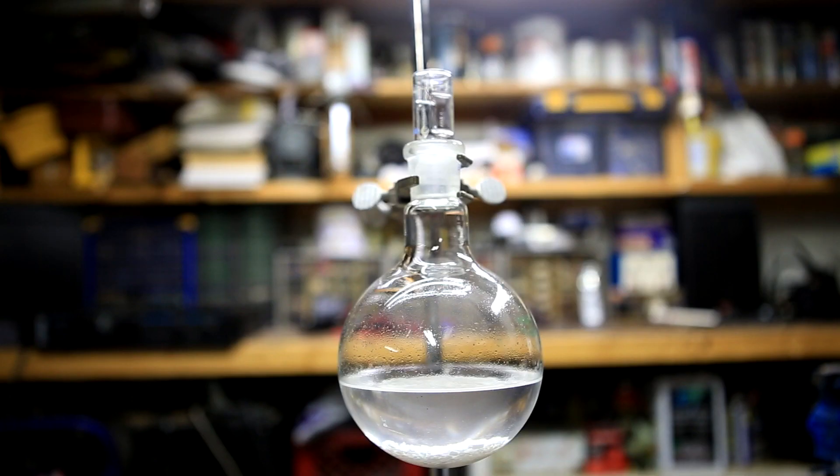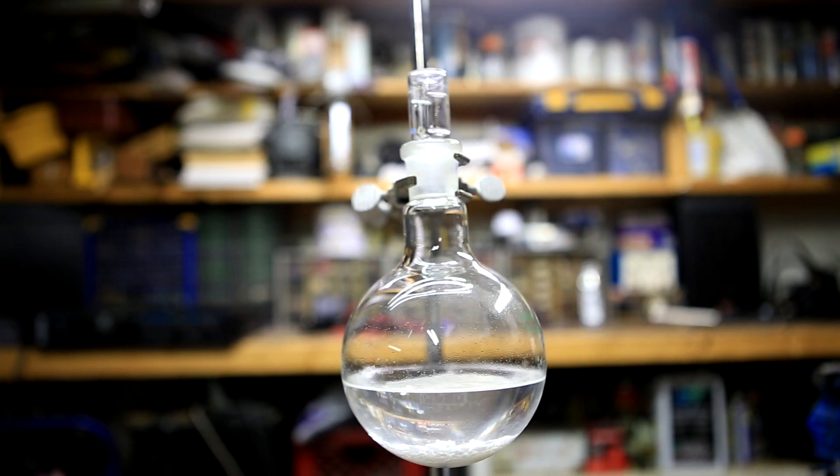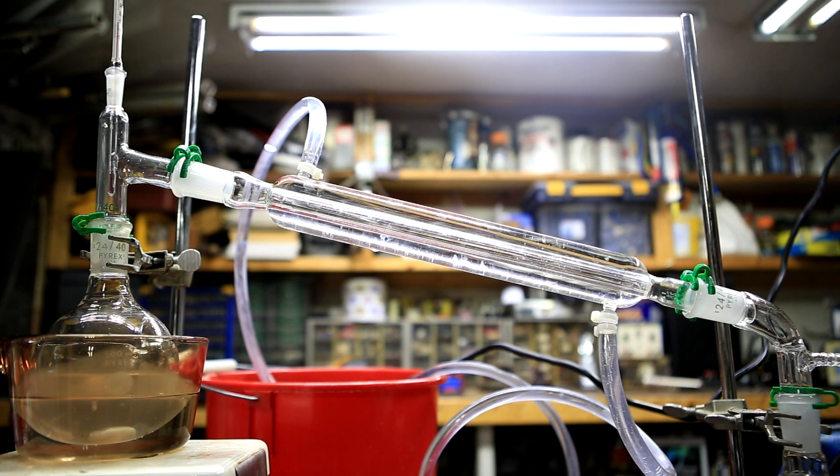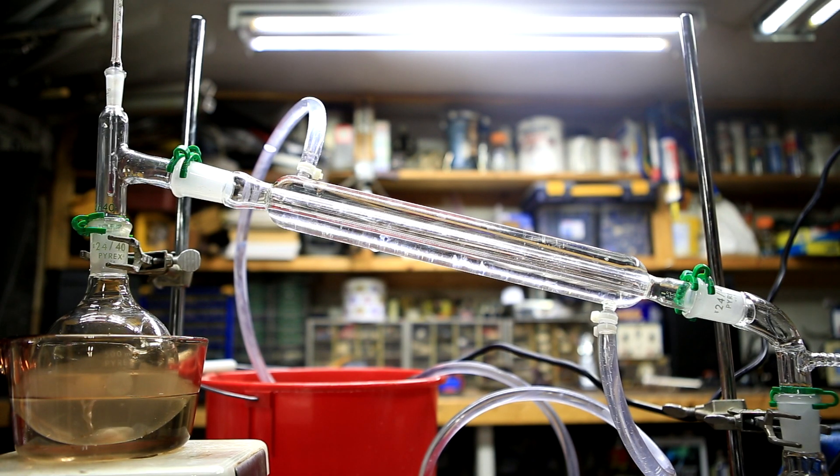The DCM from both 130 ml batches is transferred to a 500 ml round bottom. A copious amount of calcium chloride is added to remove any remaining water or methanol from the solution. The DCM was transferred to another round bottom flask and prepared for a simple distillation.